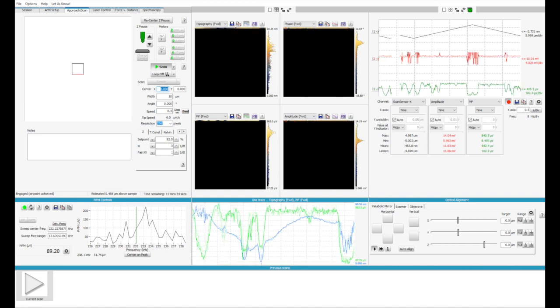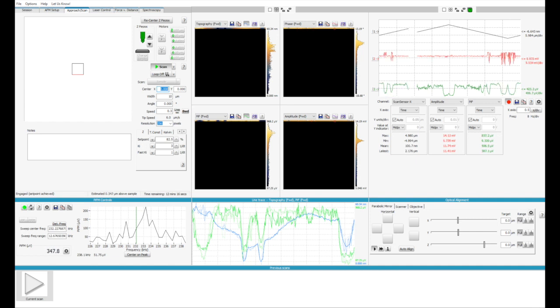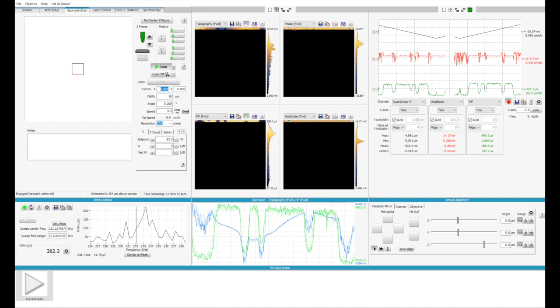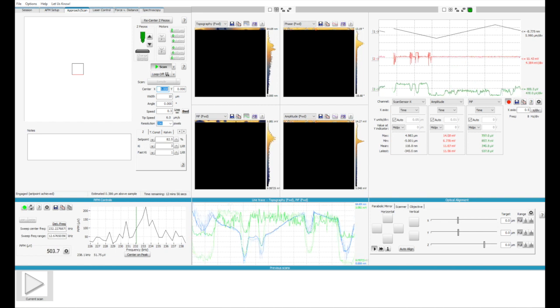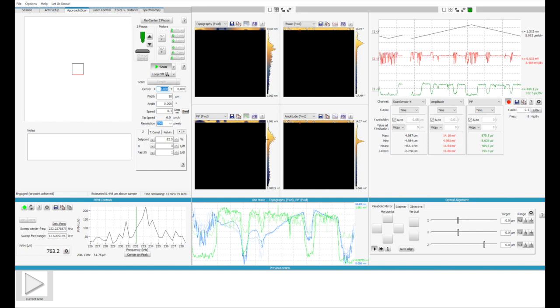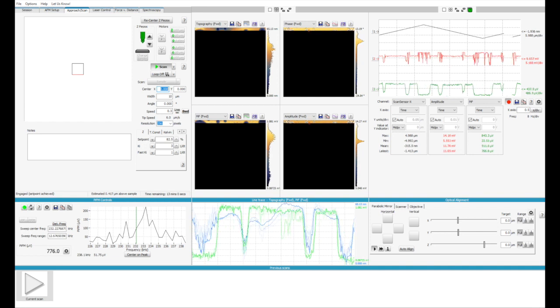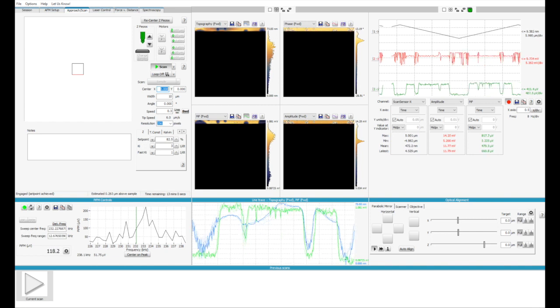So you'll see as the image is coming in, areas that are light or bright are going to be areas of high absorption, or the PLA material. The areas of the image that are dark will be that ACM material. And we just happen to know that because we've already looked up some information about the wave numbers associated with PLA and ACM. So we can let this image run a little while just to see the image build up, and we'll go ahead and take some images outside of the video session here that we can further analyze.